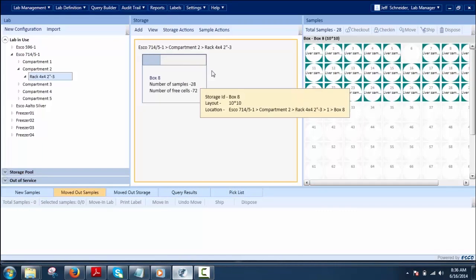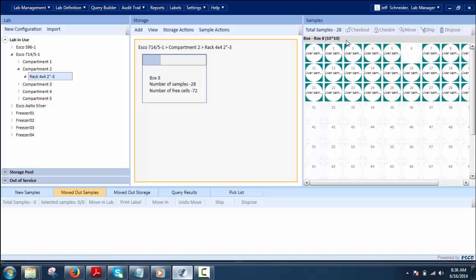There are also actions that can be performed on the sample clipboard, such as: check out, check in, move, ship, or dispose. Check Out allows users to take out the sample for processing. The user can perform this operation on single or multiple sample selections.